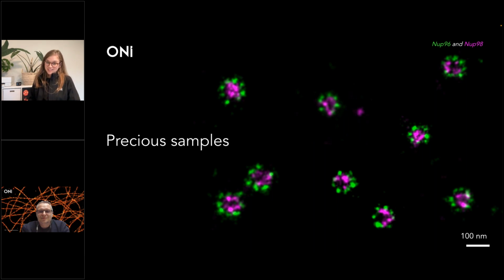Talking about other precious samples, we have a question from Max. Hi, Max. They grow cells on spider silk, and imaging the silk fibers is quite challenging. Do you have any tips regarding imaging silk fibers?